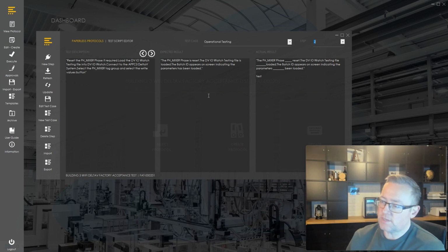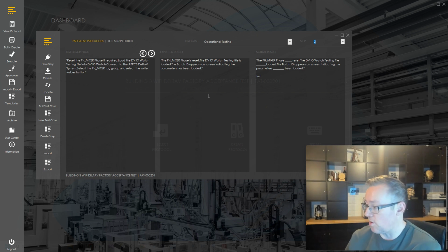My intent around this application is to make it as similar to a paper-based protocol as possible, and not to put it in a position where it competes with the document management system and the standard approvals. The way I would want it is that if it were used, it would fit into a situation where you could pick the paper-based route or the digital route.